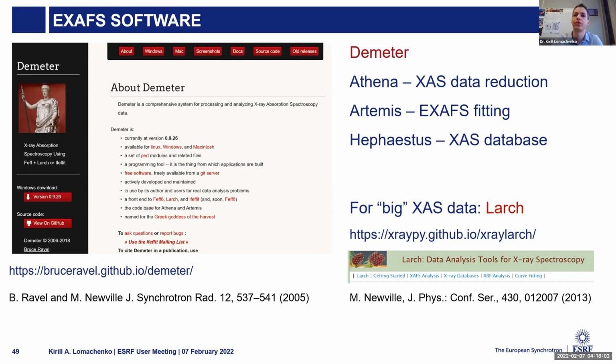You can write your Python scripts for analysis of the data, where you can use the Larch libraries. It's a very powerful tool, actively developed by Matt and also by other contributors. But this is probably for more advanced users.